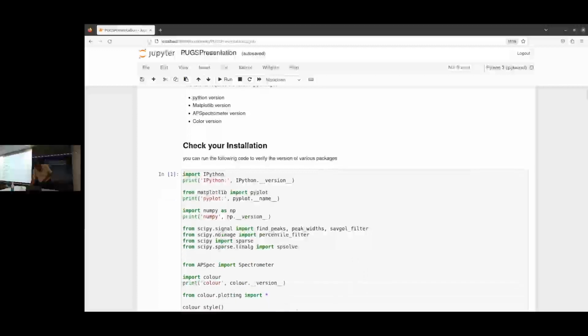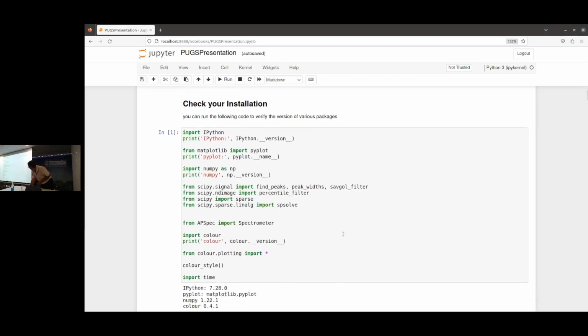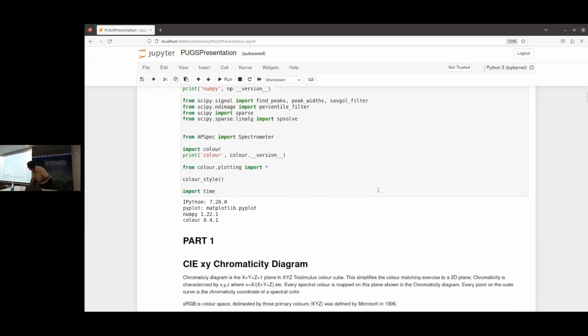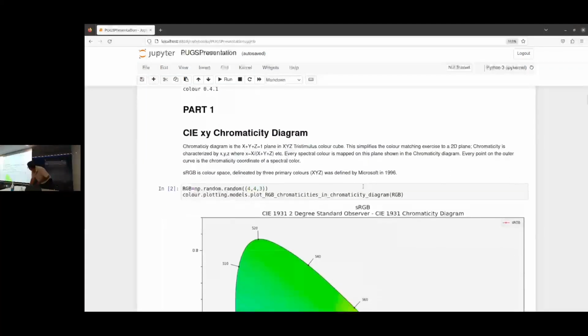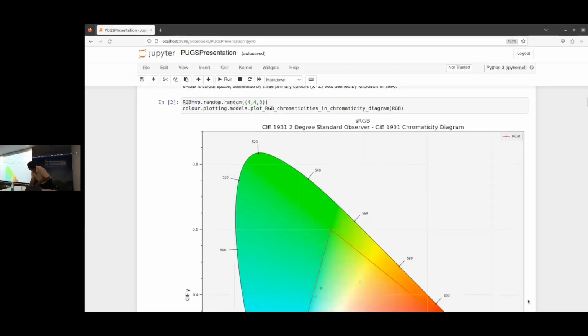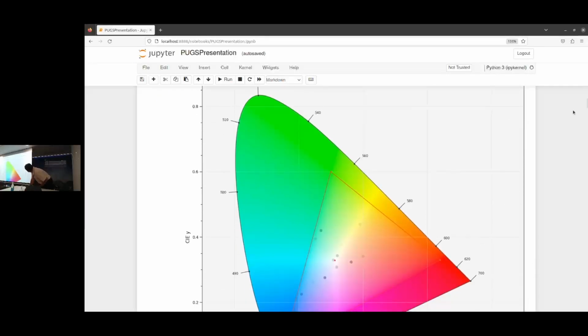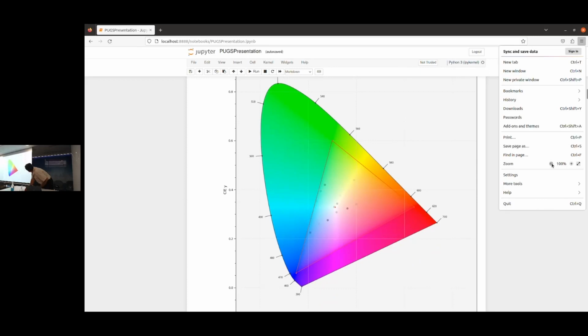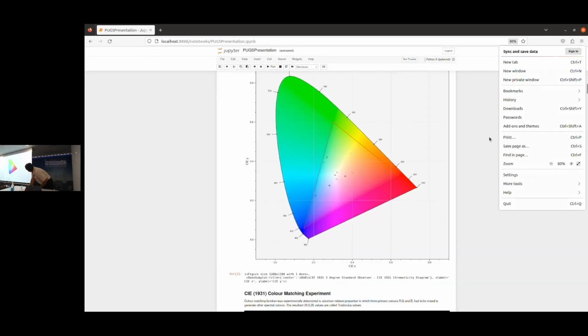Now, it's almost impossible to do justice to a color measurement topic in 10 minutes, but I'll try. There are a bunch of packages I have loaded over here, no particular dependence or such that I have worried about, but it just works. So the best way to start is to dive straight in to talk about how we specify color. Let me make it fit the screen, so you can see all the axes.